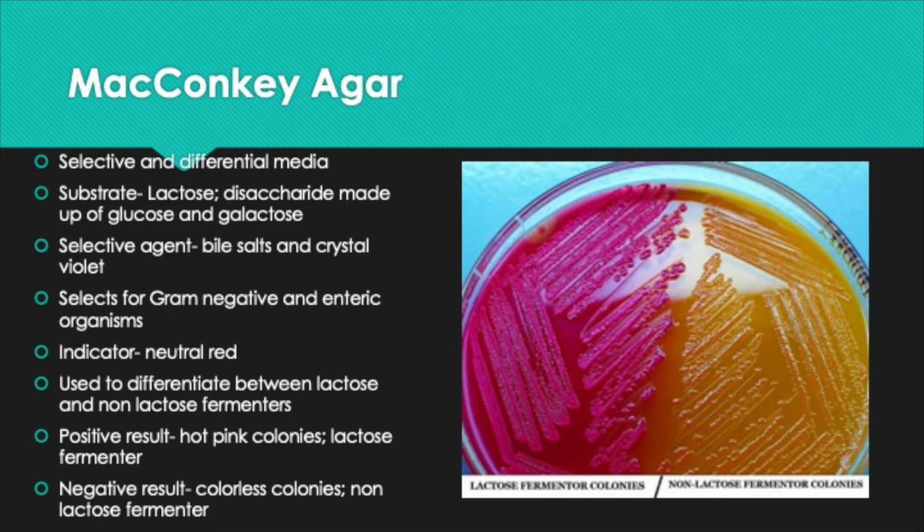If fermentation does not occur and the bacteria uses the lactose for respiration, then you're going to get water as the end product, okay? Because that's the end product in respiration. You get water as your end product. That is a neutral or basic end product. So we have fermentation, which is acidic end products. We have respiration, that is neutral or basic end products. So to be able to test to see which one's happening, we need to have our pH indicator.